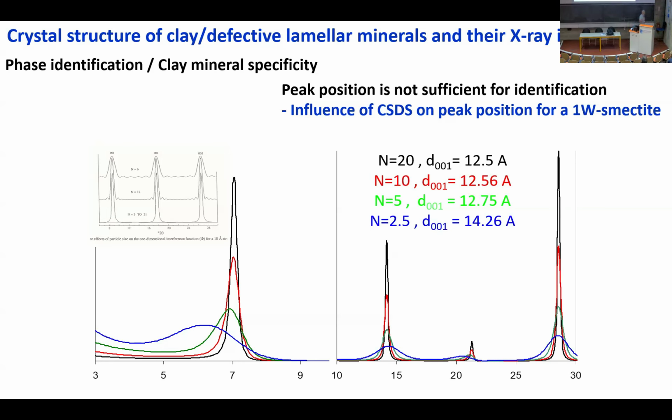In this case, if you want to compare one sample from the other, something you may want to check is whether the change you are seeing is just a function of broadening of the peaks. You can see here that I am able to measure the exact same periodicity in this region, just because in this region the structure factor is essentially constant.